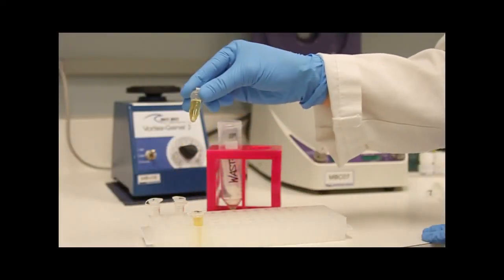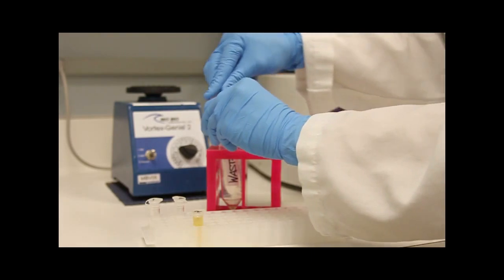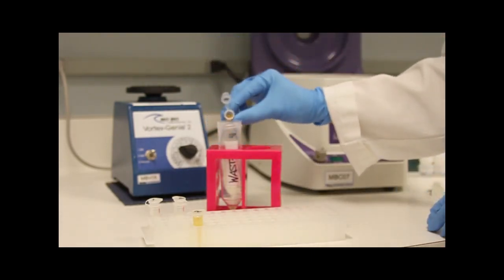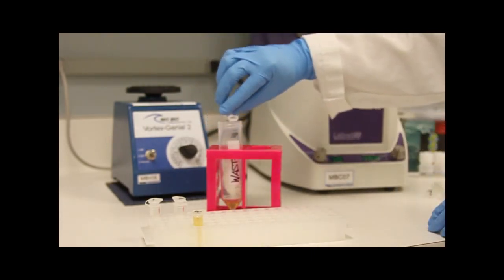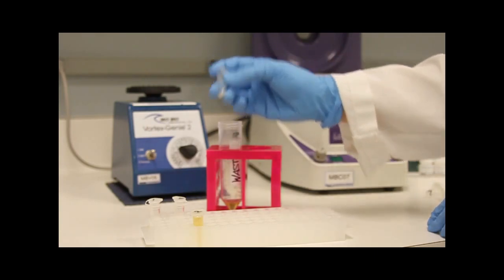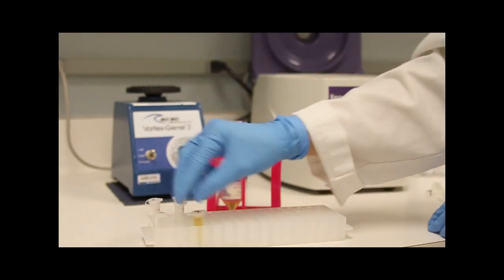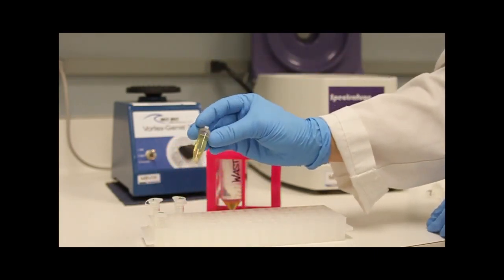Decant the supernatant by inverting the tube and pouring into a waste container. If you are using the 6-Minute Kit, continue with the next step of the protocol. If you are using the Standard Kit, add up to 2 mLs of the remaining culture to the pellet and repeat the steps of centrifugation and decanting.